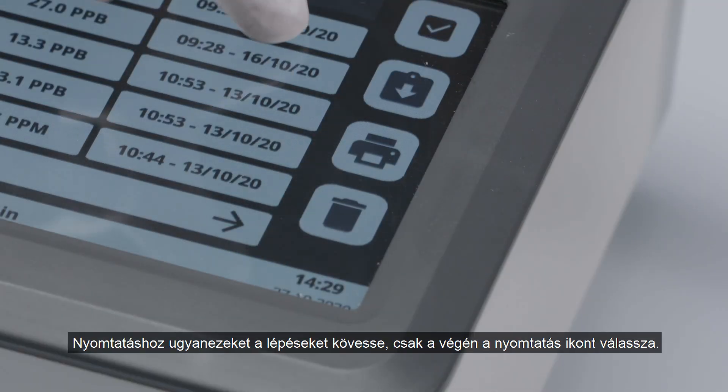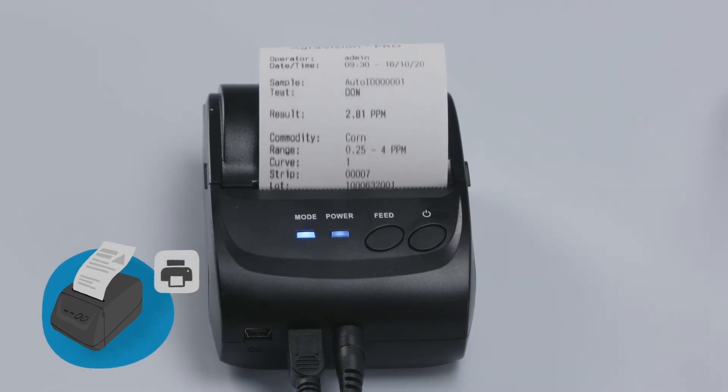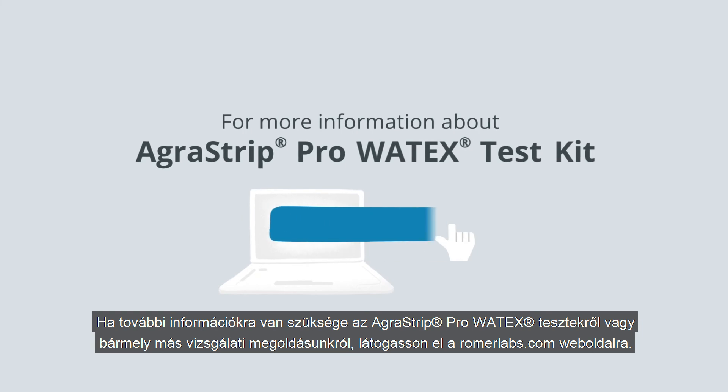To print, follow the same procedure and select the printer icon at the end instead. And that's it! For more information about AgraStrip Pro WATEX Test Kits or any of our diagnostic solutions, visit us at RomerLabs.com.